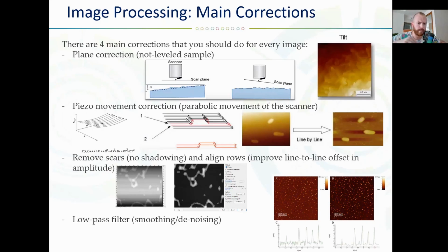In contact modes, it's okay because you're standing on the sample, but in non-contact modes, you have an all-the-time oscillating cantilever, and you're bumping on the surface. So if you allow this high frequency noise to pass, loud speaking is enough, you will affect these oscillations, and you will affect the resonance frequency.